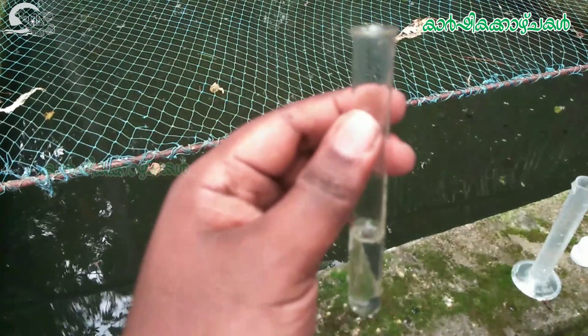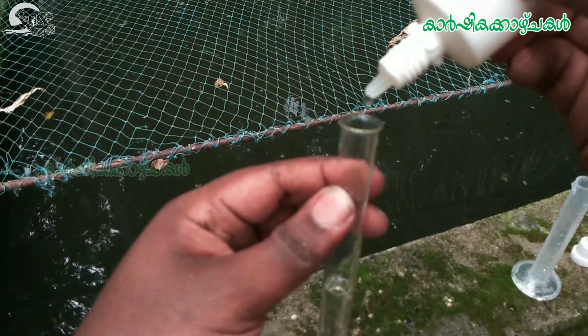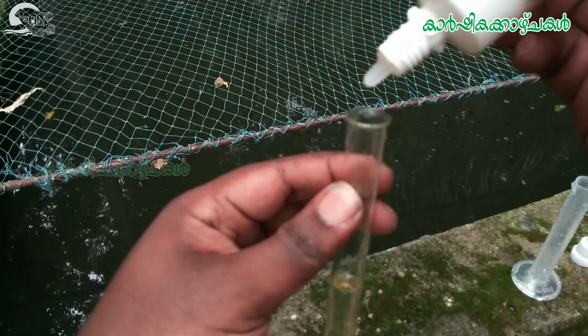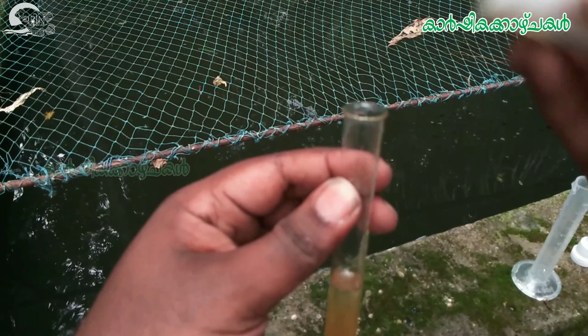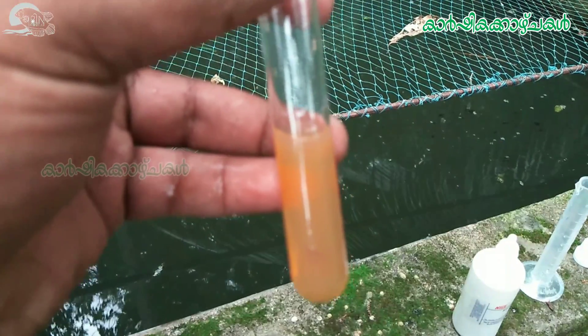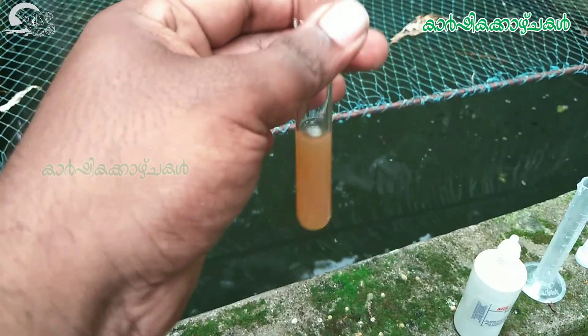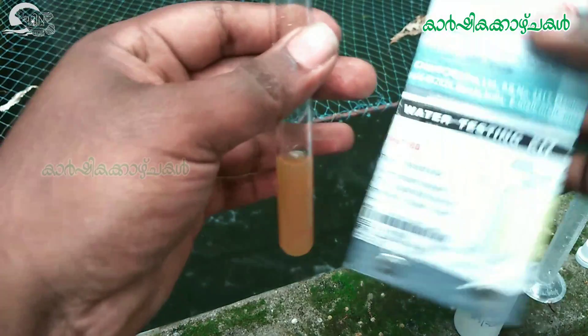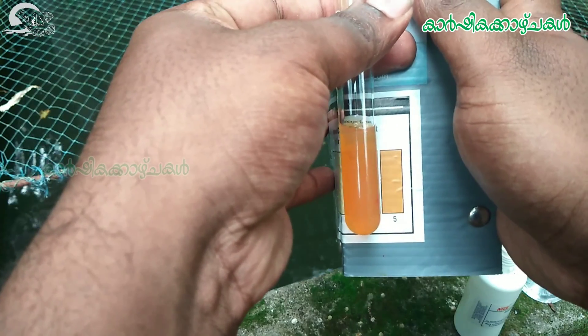Ammonia reagent — let's put it in for 5 minutes. Let's shake it. The color is done with the test solution. Now, let's put it in the kit and add our water sample to this kit.